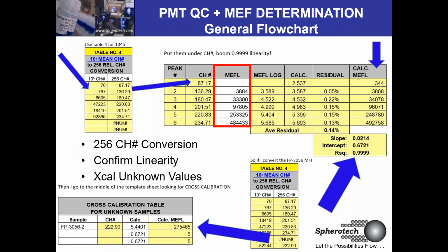And then visually, I saw it was around that second to brightest peak. Well, does it have a similar MEF? Yes. So that's good. Probably means the macros are all talking to one another. This is some of the power that we're talking about.